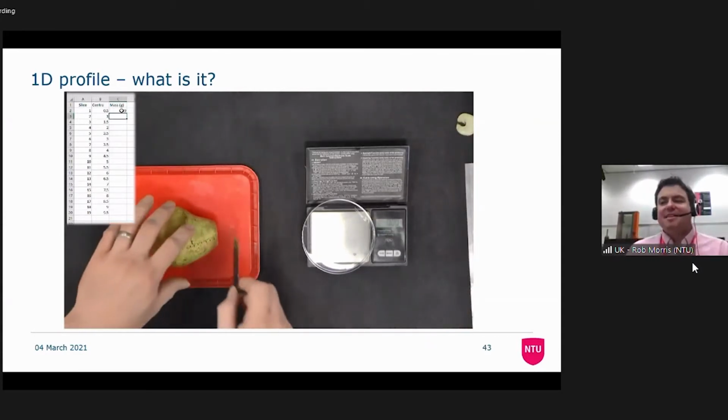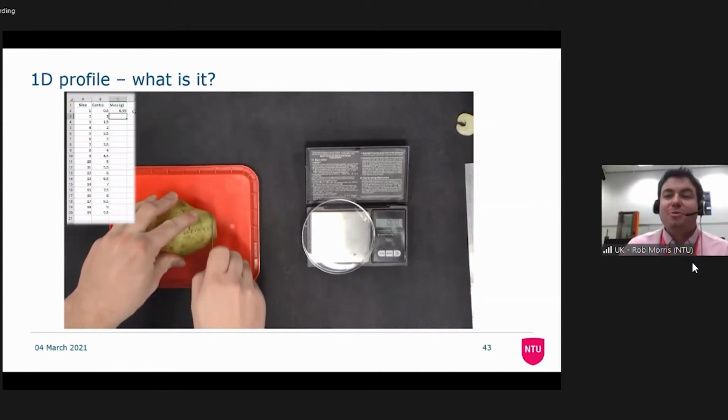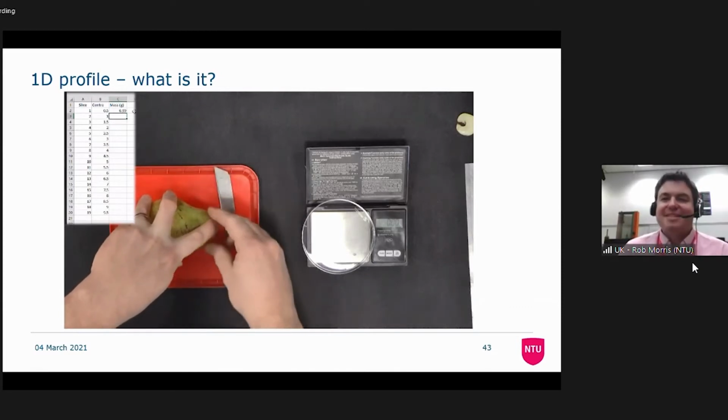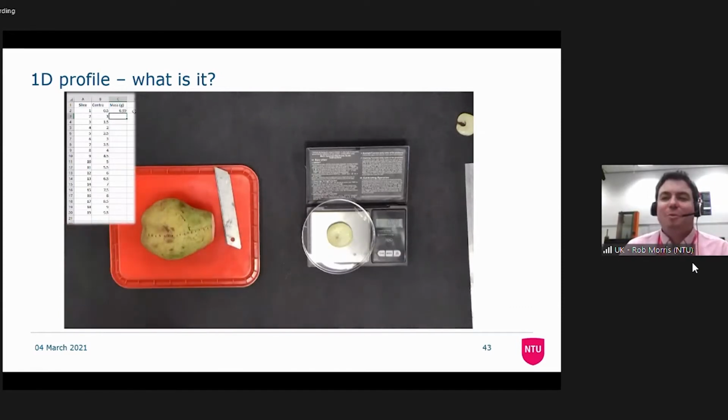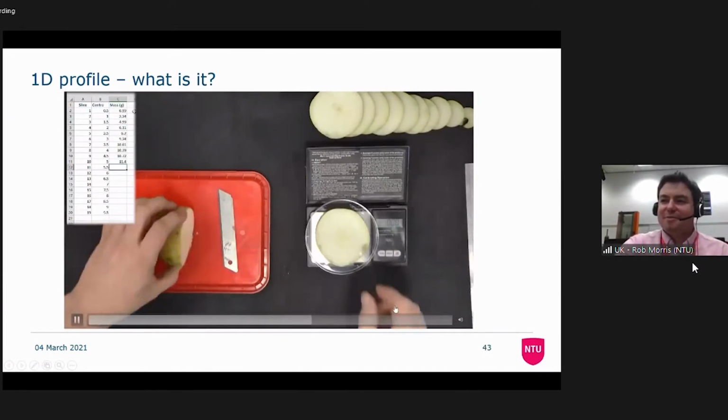Okay, and this is the first experiment we will normally do if we're working towards building a system with imaging. Step number 1, can you do NMR? Yes, excellent. Step number 2, can you get a 1D profile with it? Because we only need to do one more thing than we were already doing to achieve this. So we'll skip through a little bit more. We go into amusing fast motion anyway.